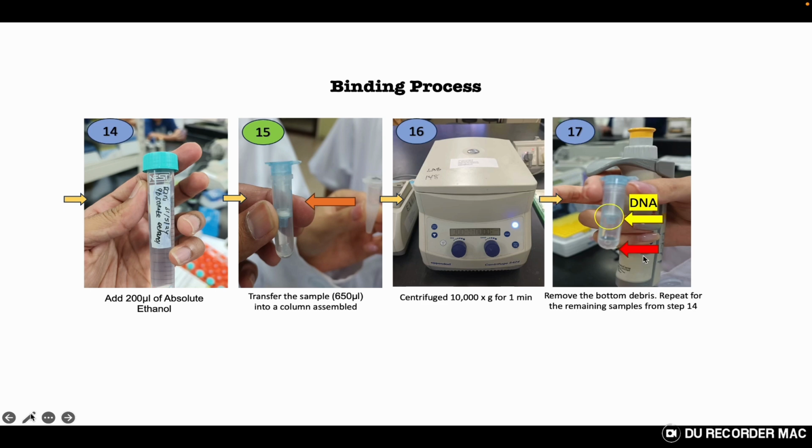In this process we repeat for the remaining samples from step 14 until our samples are finished, and we get the DNA stuck at the top of the filter.